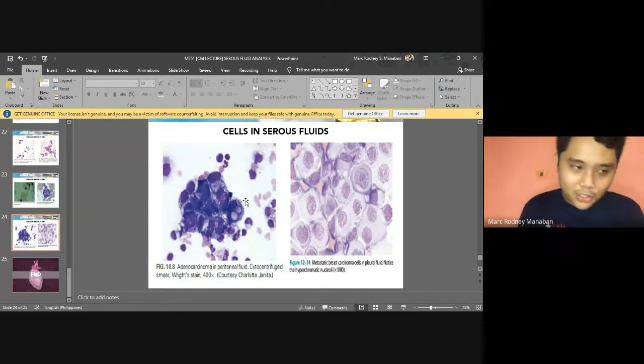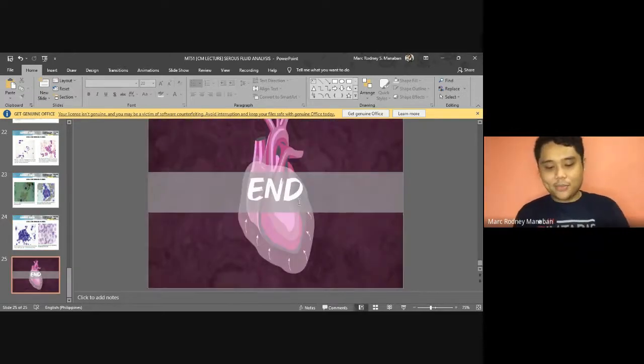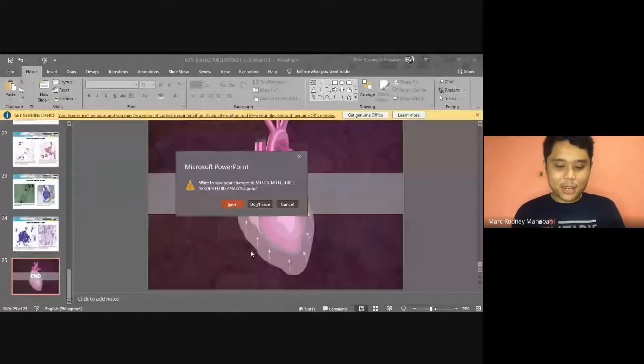So be careful. It's not unusual to receive body fluids in your rotation in the hospital, especially in the CM. Make sure you check the request form as I've mentioned, because these body fluids may look like urine. If you miss it and don't recognize it as serous fluid, you might process it as urine. So be careful. That's what I've been emphasizing to you, especially next semester when you go to the hospital. And that's the end of the major body fluids that are important.